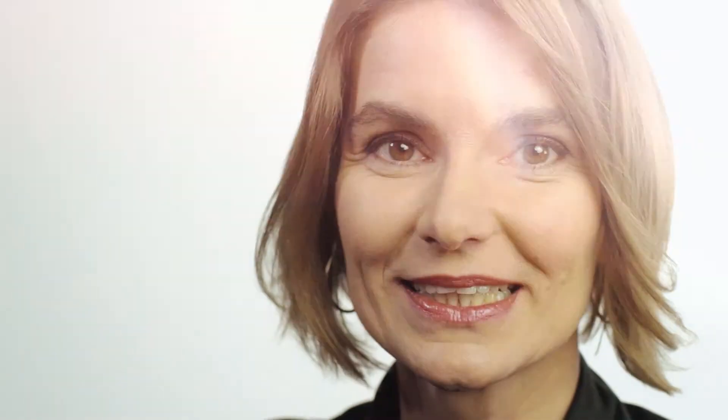This very clever microscope is made for you. And the best part is, you can afford it.